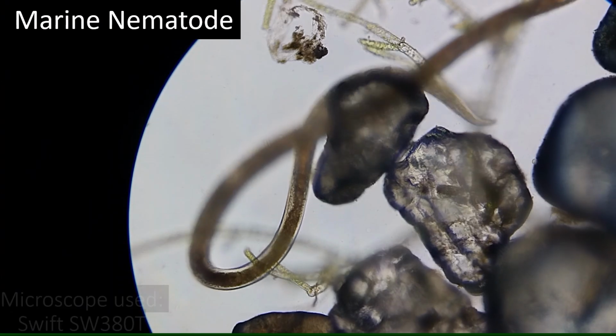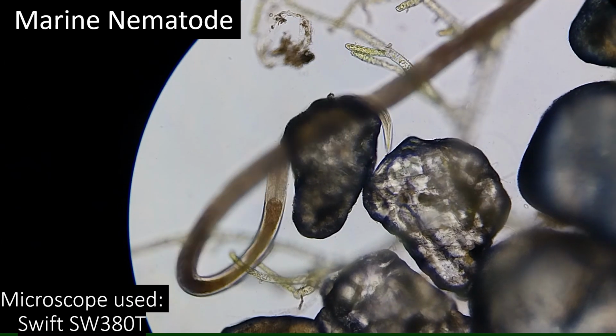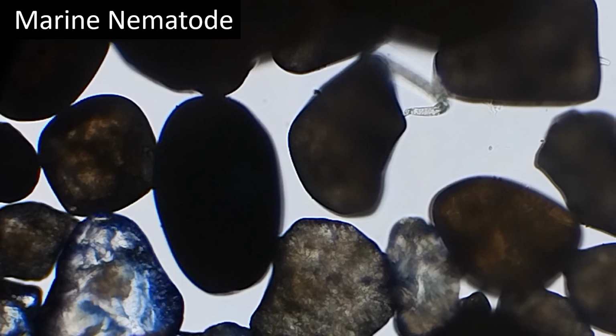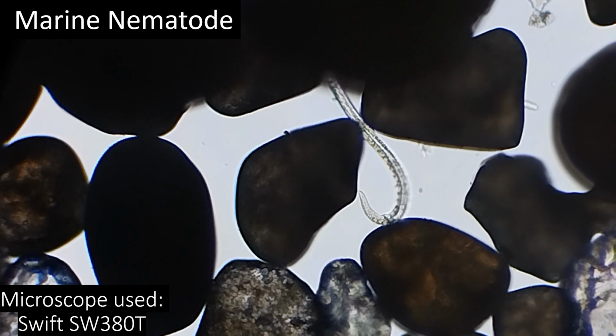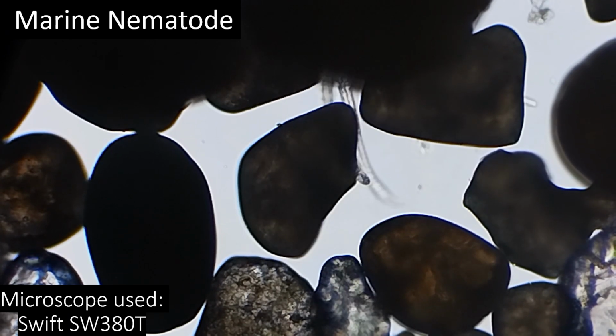This worm crawling between the sand grains and algae is known as a marine nematode. Nematodes live in a wide variety of freshwater and saltwater habitats. Marine nematodes generally live their lives attached to marine algae or in the beach sand.